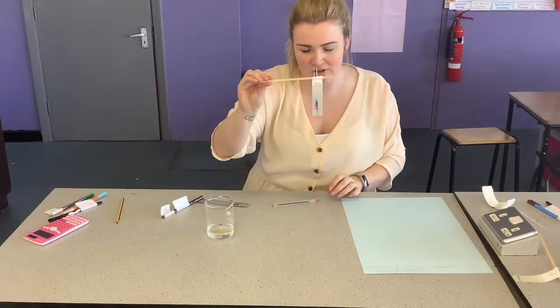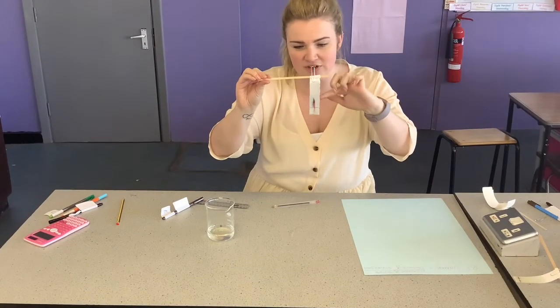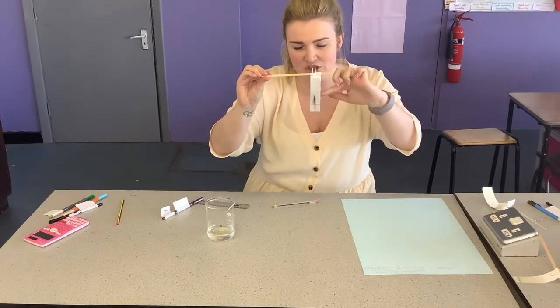This is a completed sample that we've run a brown colour through. You can see that it's made of loads of different colours. So brown is definitely a mixture of different inks.